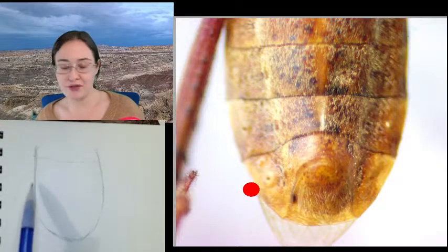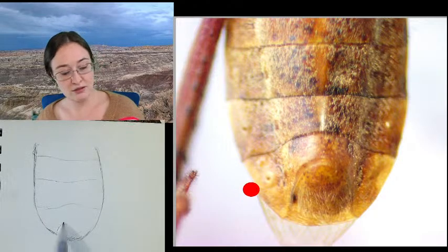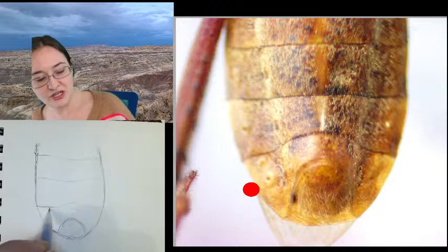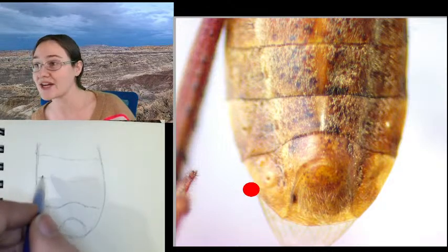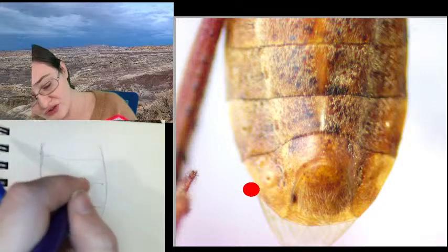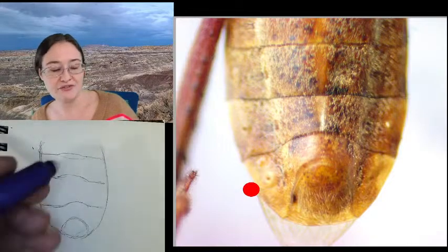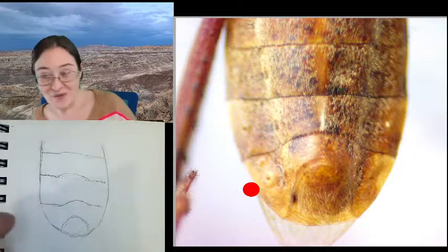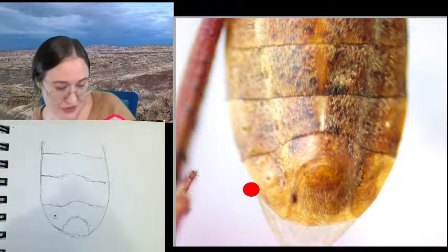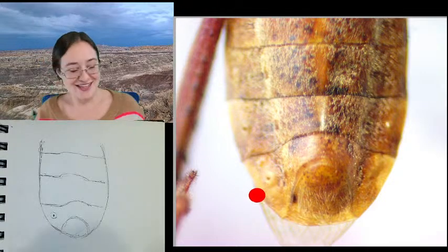So if I'm going through and sketching these segments, all right. So we've got these individual segments, and they have a little bit of shaping to them just because the body actually has this kind of arched shape. So when you're looking at the lines from a ventral view, they kind of look like they arch a little bit, and that's going to give our specimen a little bit of shaping. Now, right about where my red dot is, you'll be able to see a little itty-bitty dot with a little circle around it. All right, that is right about here. And that is our spiracle.